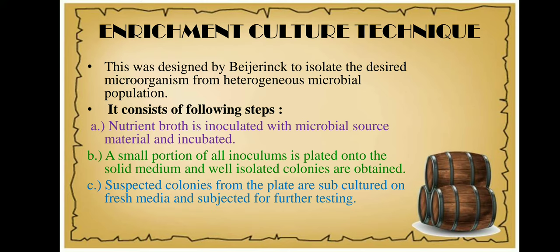Casein is a protein, so a zone of clearance around a colony means it has utilized the casein in the media, indicating it is producing alkaline proteases which have degraded the casein. I will take this colony, subculture it, and go for further testing.